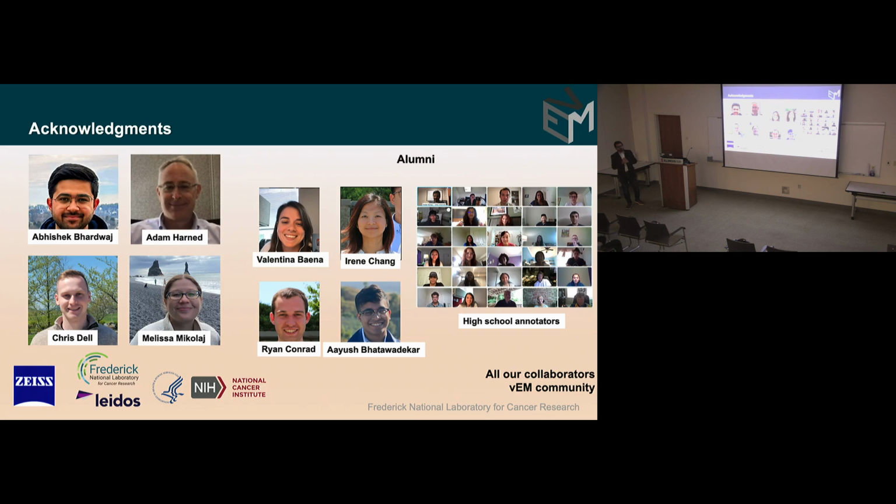But the way you would do it is there is a module where you can create your own model. Typically, it says pick n number of patches. That's left up to the user. It could be 32, it could be 64, any number, and you can then choose those patches at random through the volume, or choose them yourself.